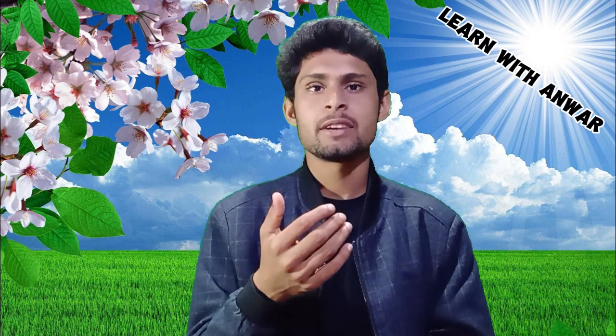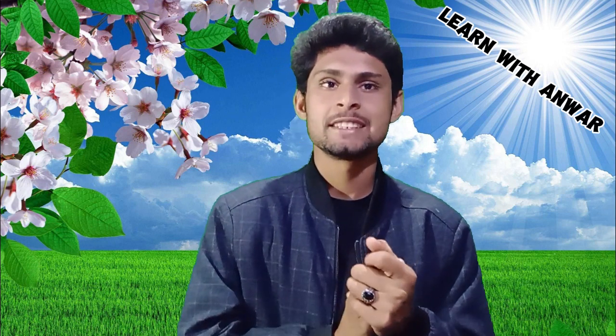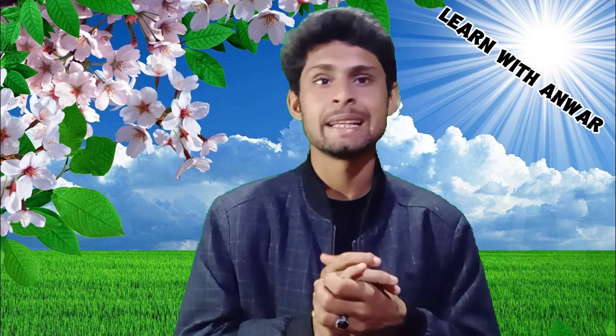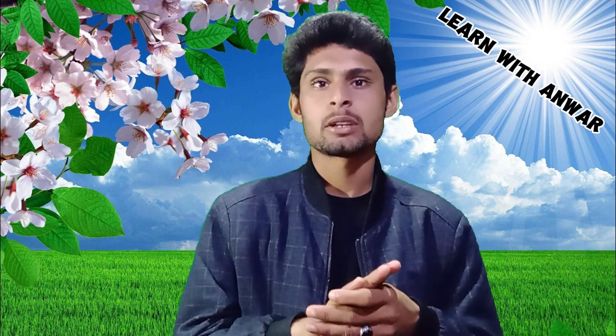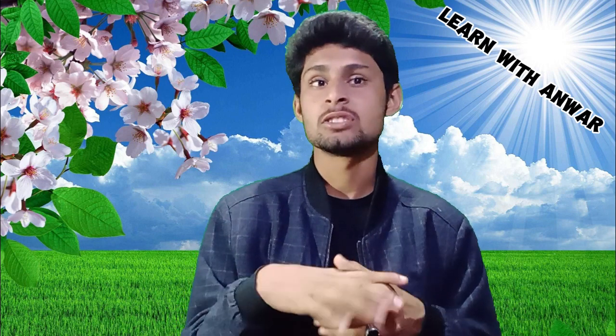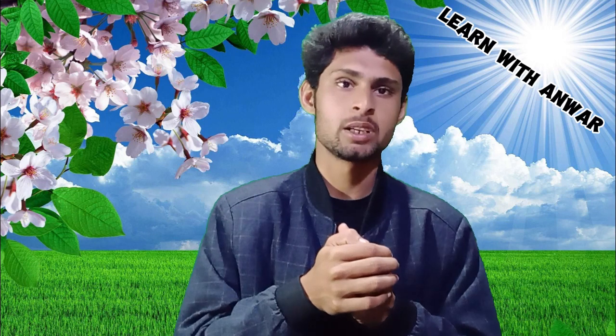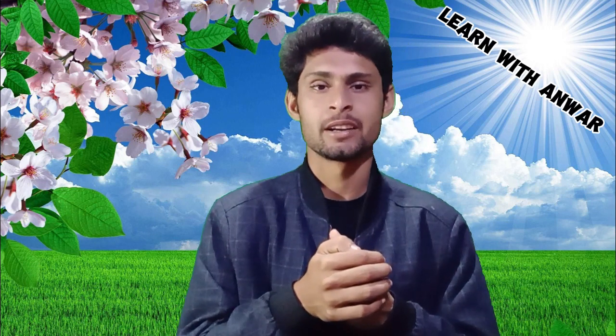These are generally referred to as eye loupes or jeweler's lenses. The traditional simple microscope was made with a single magnifying lens, often of sufficient optical quality to allow the study of microscopic organisms, including hydra and protists.